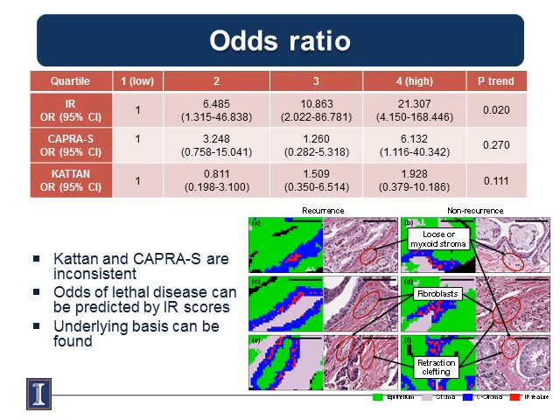We can also point out where in the tissue we're getting this discrimination from. So what we're doing in our lab now is going and cutting out these places that IR imaging has identified as being dangerous in the tissue and looking at the genomic analysis and other molecular techniques with this. So we can figure out where things are going wrong and where it's coming through.